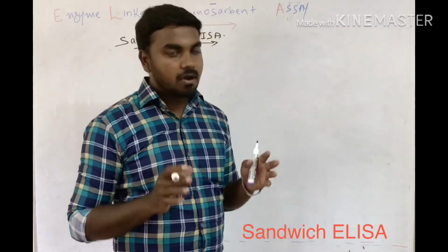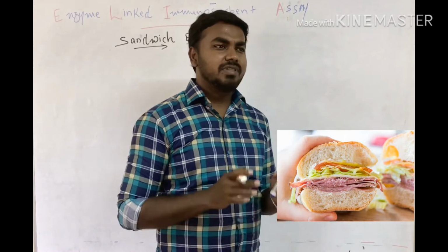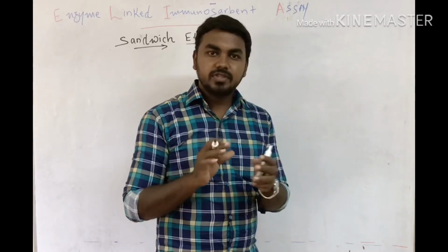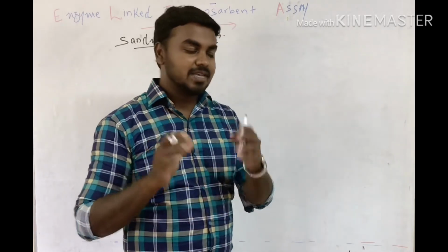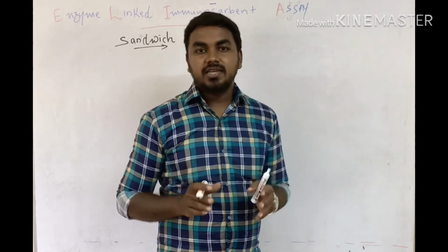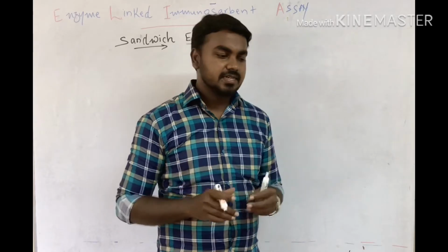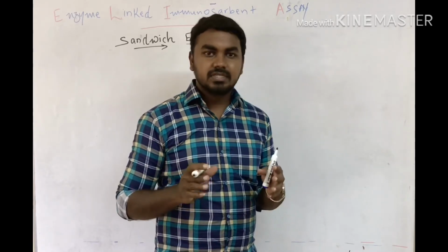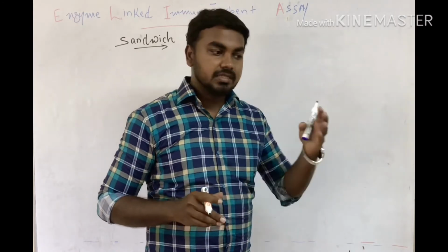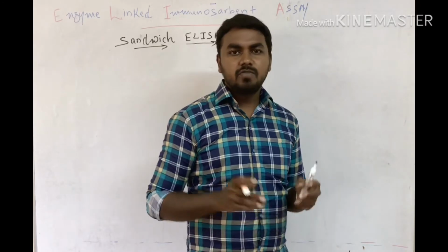So we all know what a sandwich is, right? We used to have sandwiches. Something related to that kind of structure is related to this ELISA technique, so that's why the name was given. Why is sandwich ELISA more important than other ELISAs? It's a very sensitive technique, and the quality of the technique is much higher than indirect, direct, and competitive ELISA.